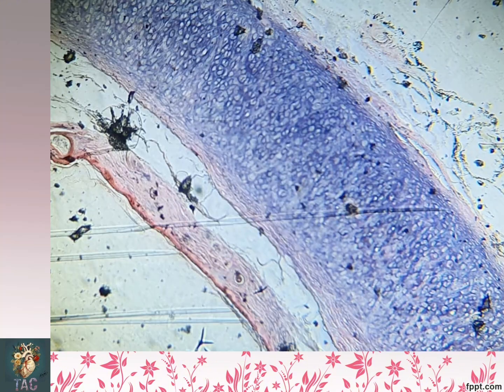Again another slide taken at lower magnification — this is also the slide of endochondral ossification.